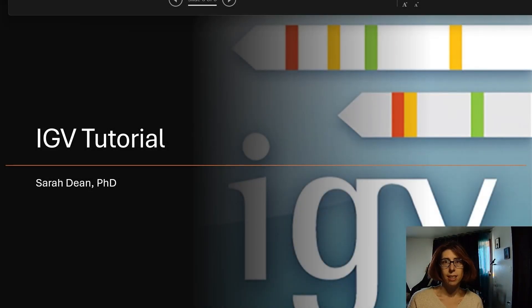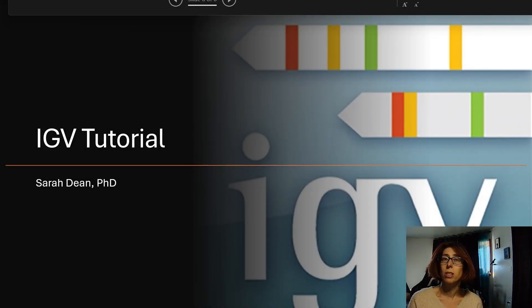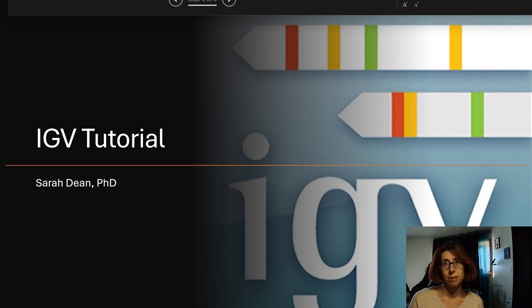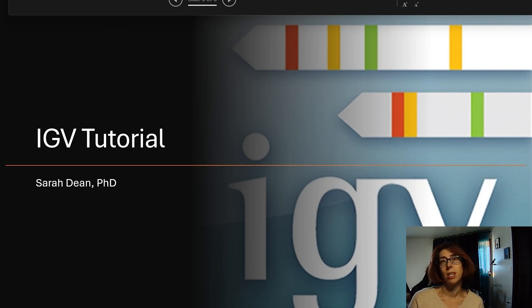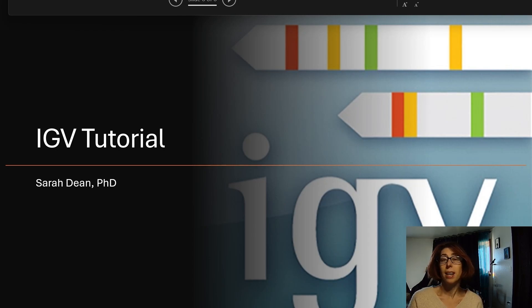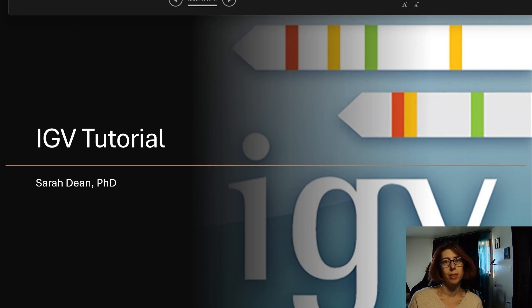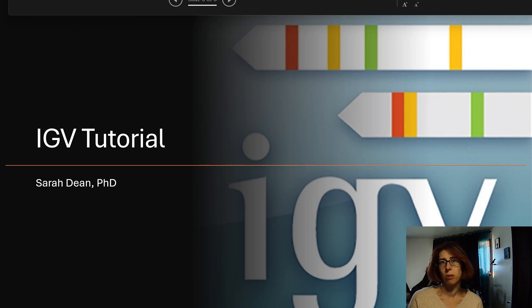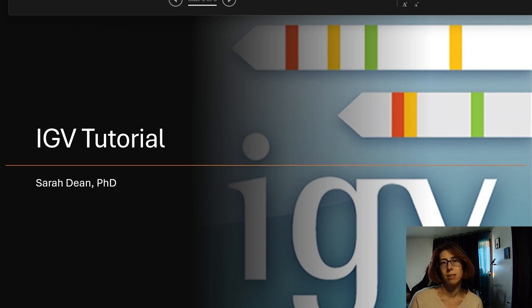Hello, my name is Sarah Dean and this is video three in a tutorial series on using IGV. In the previous video I went over some of the file types used for variant viewing and interpretation in IGV and how to load and display them in IGV. In this video we'll go over basic IGV functions that are useful for viewing and interpreting variants.